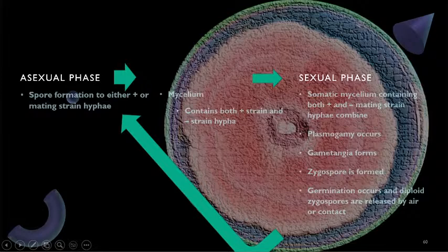So see, kung natapakan or nabugahan ni Mark Segi yung mycelium, doon siya nag-spread.